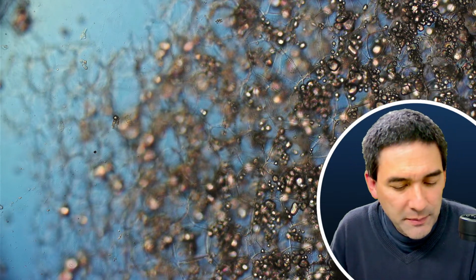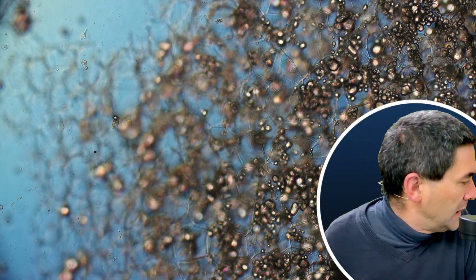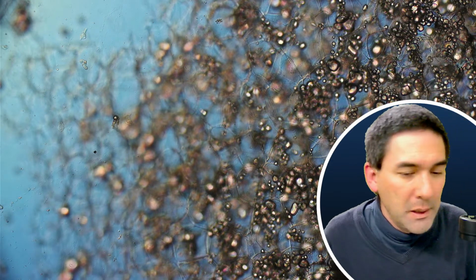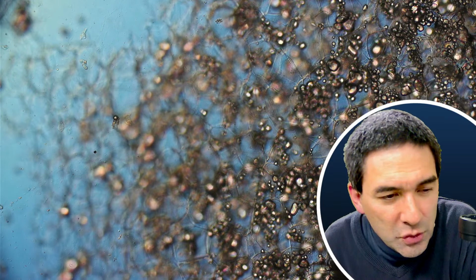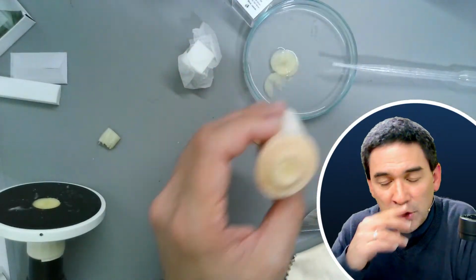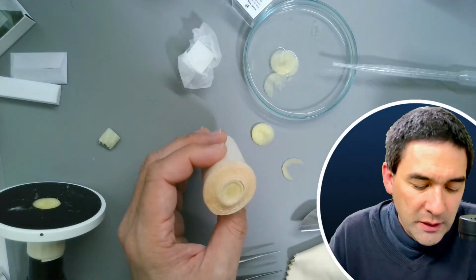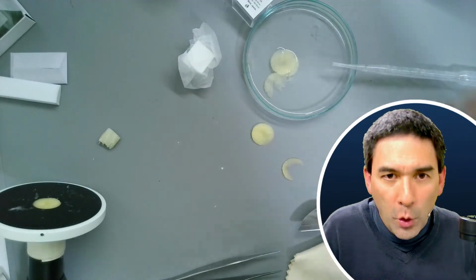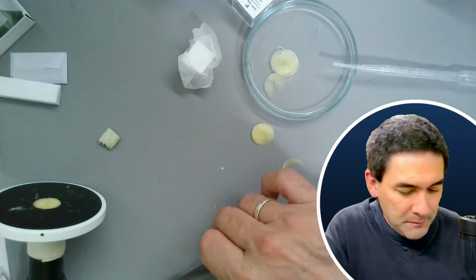That's actually something that I wanted to do anyway. I don't know if this is going to be so easy to do, but that's the reason why I'm going to show you. Thank you for reminding me. I just want to show you how you can use carrot, and that's why I have the carrot here, as a holder for thinner specimens.